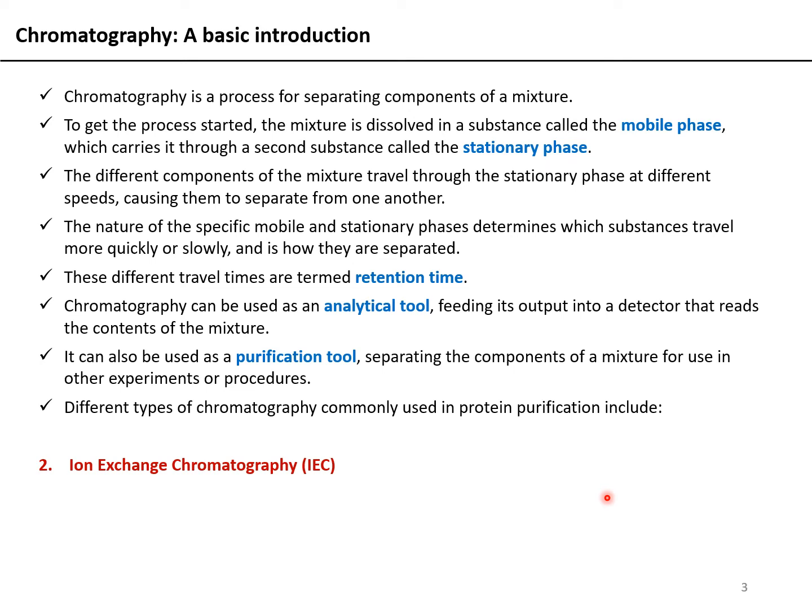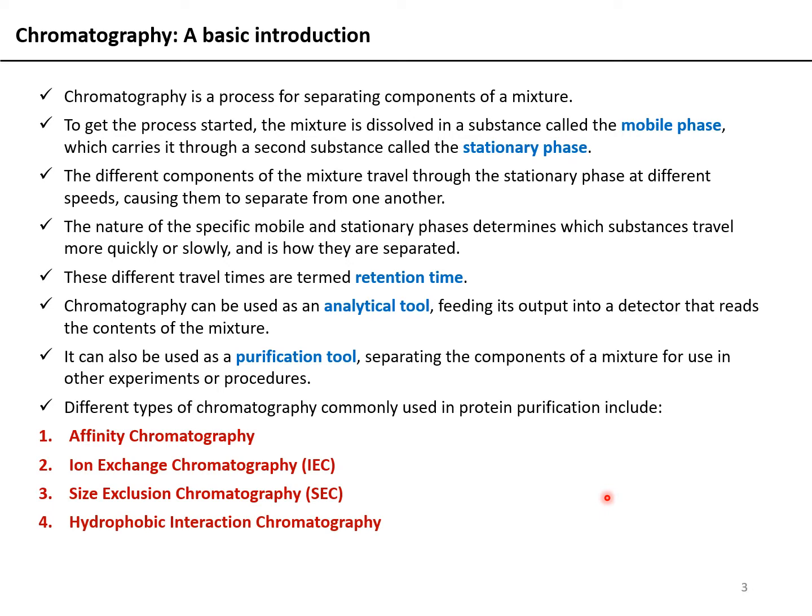I'm sorry, I think there was some animation error, so number 2 came up first. Affinity chromatography, size exclusion chromatography, and hydrophobic interaction chromatography.